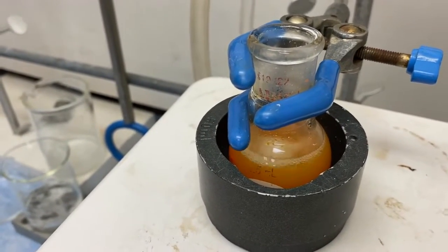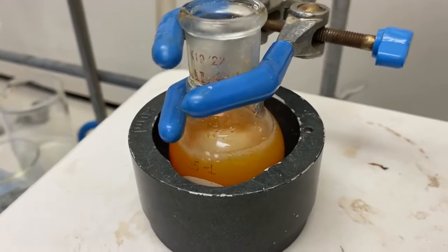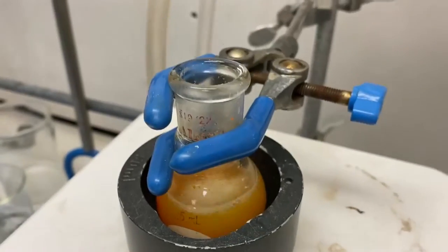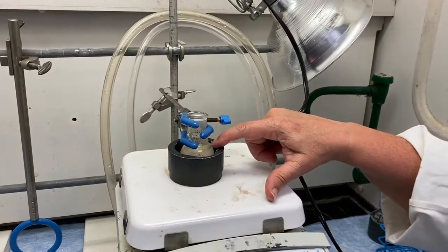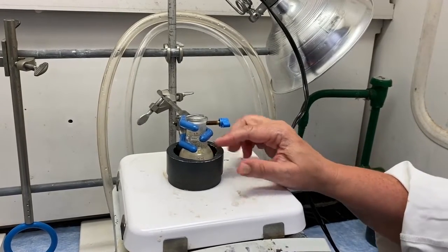When you do your percent yield calculation, you will not be using sodium borohydride because it'll be assumed to be in excess. Now you can see that our reaction mixture has lost all of its orange color, which means we've had complete reduction of all the imine.